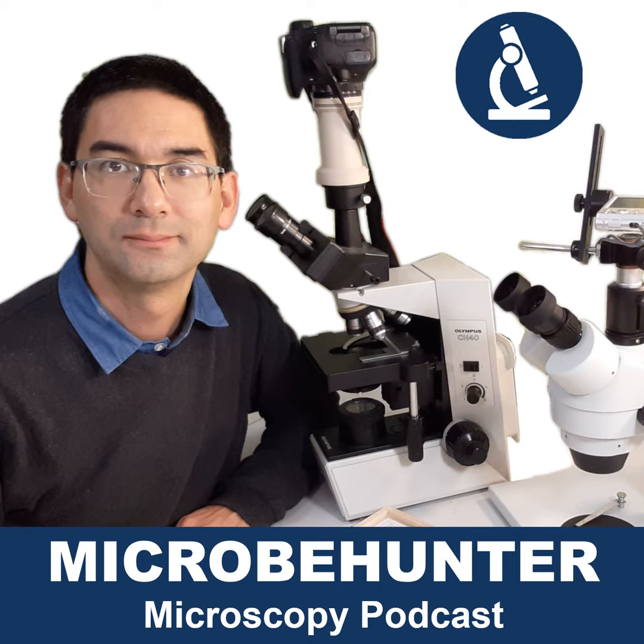As I already mentioned, Leica is the only one that I know of right now that has a few microscopes also using the 160mm standard because they have got an educational branch as well. For those lower cost microscopes, they still use the 160mm DIN standard. For all of the other microscopes, you are now bound to go for the infinity system.